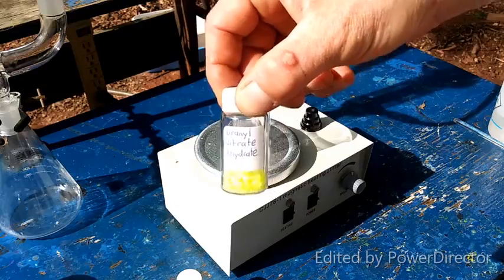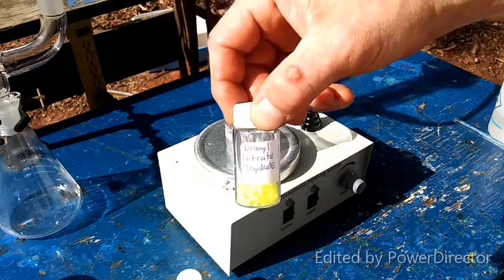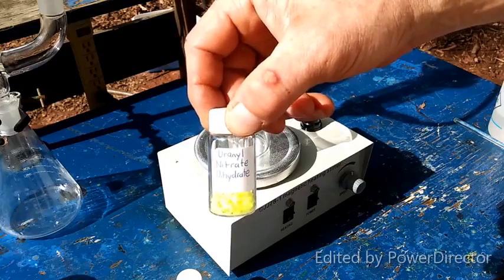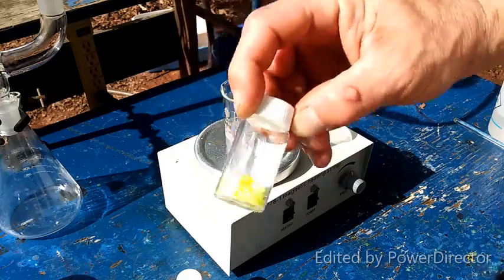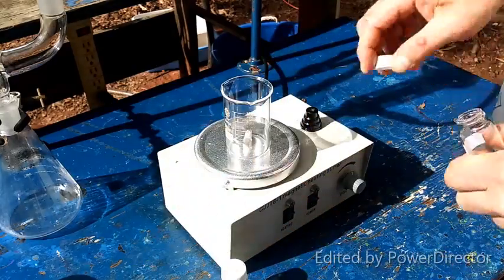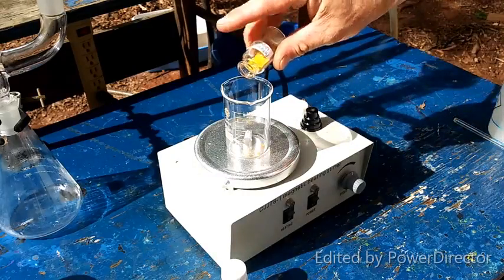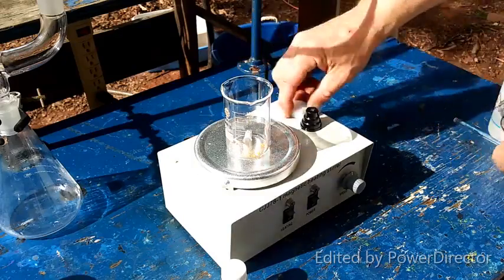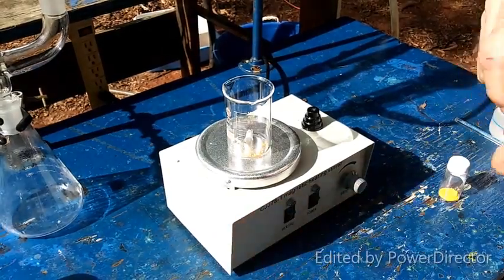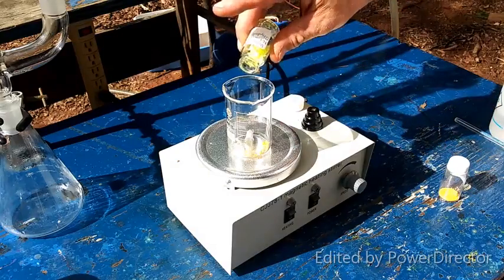This is just uranyl nitrate that I crystallized. There's nothing to it. You just make it like you did in the first video and then evaporate it down till you start to get a gooey solid, reconstitute, evaporate down over and over till you finally get something nice and crystalline. So, according to Atomistry, we want a little bit of alkali uranate, not a whole lot, and we want an excess of uranyl nitrate or sulfate. It says that either one will work, although I've only ever done it with the nitrate.